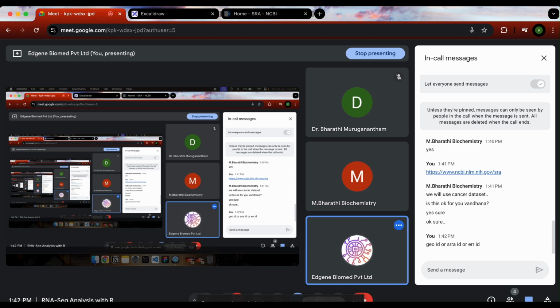If that data is publicly available, you can use that data for your publication. Unless you are taking permission, citations, everything, that is the normal thing which we do. So this is one simple way where you have all the information with you.